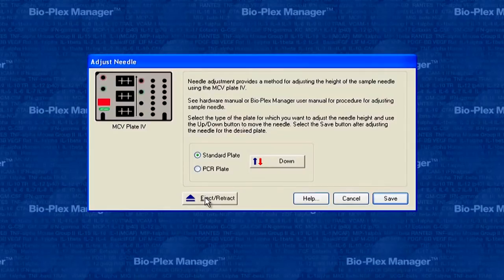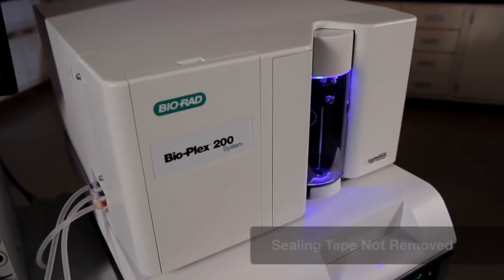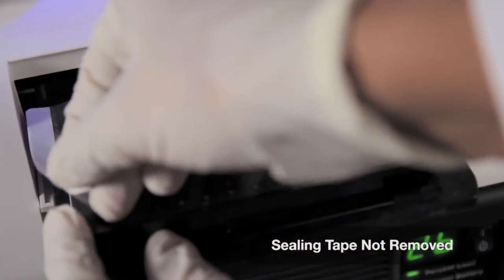Presence of sealing tape on the assay plate during data acquisition hinders probe movement into the well. In this case, clicking eject and removing the sealing tape before resetting the plate in the platform for acquisition ought to resolve the issue.